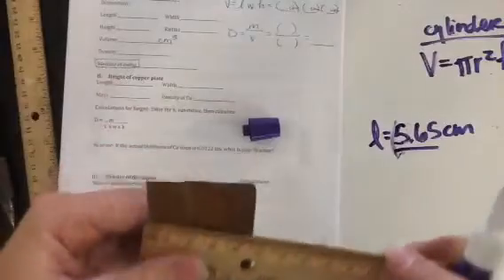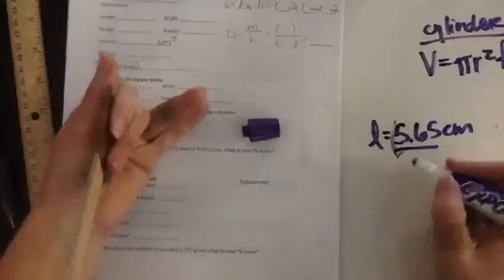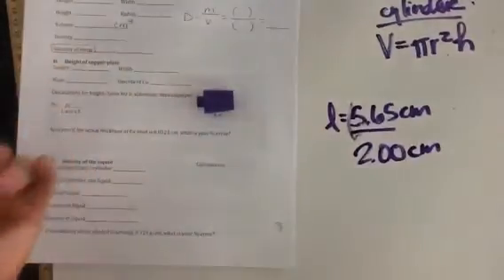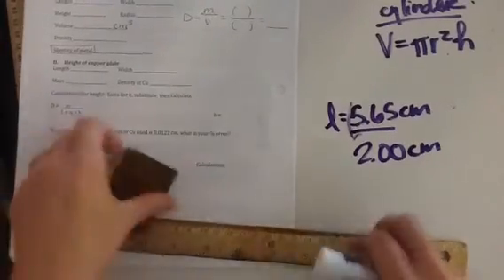If you measure it and you're like, oh no, that's exactly on, then let's say it was exactly 2. So my answer is 2.00 because that's the level of precision that this ruler communicates. Make sure that you keep that in mind when you're making your measurements.